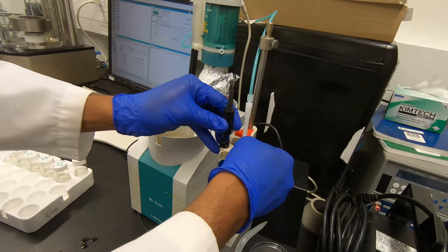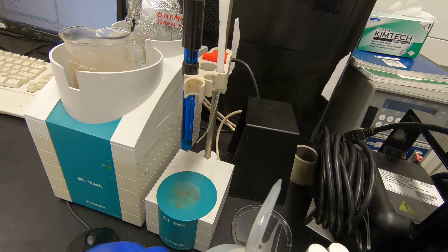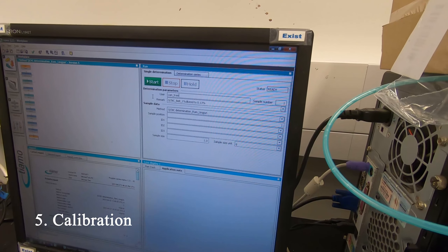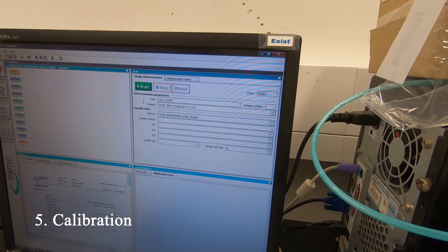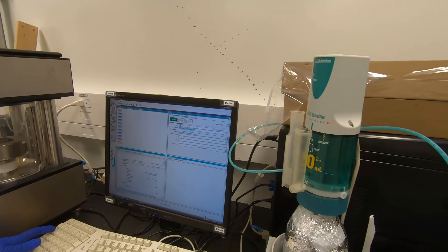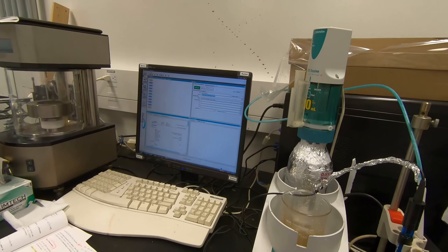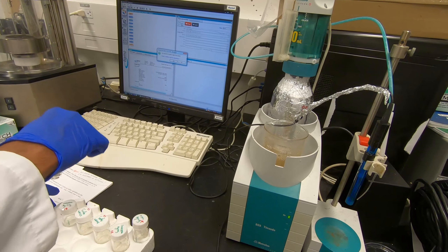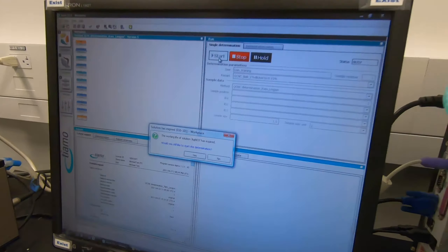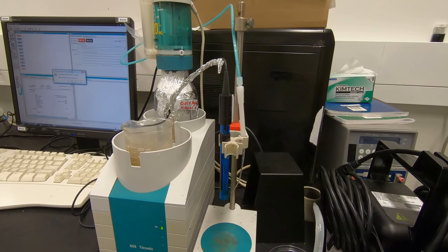The electrode is ready. We start the method here - I'm putting your name in. This is the same method we're going to use. Just press start. Press start before the coverage. It says the working standard is expired but it's starting the calibration, meaning it's asking us to replace it - but we already did. Just press yes.